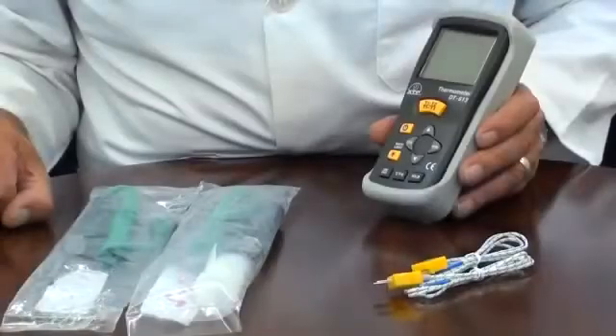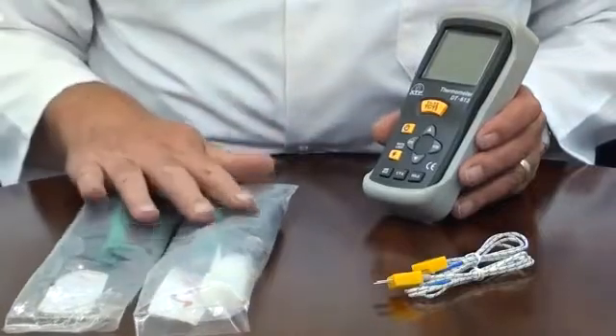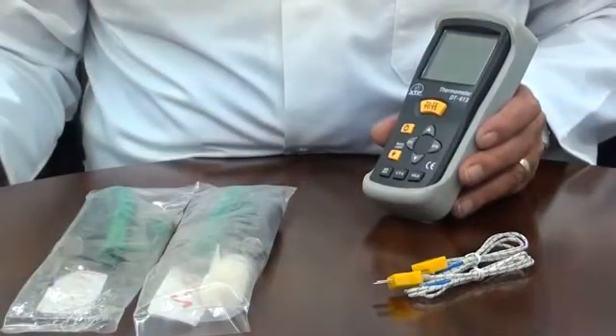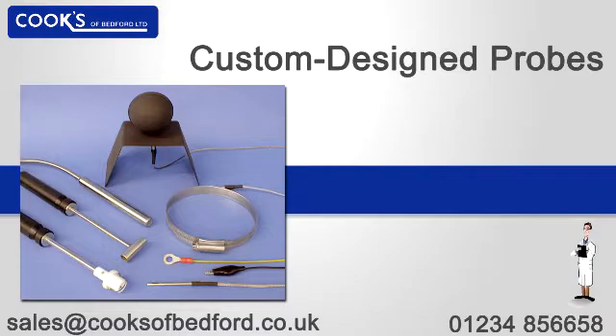The thermometer is ideal for many applications as we offer a range of interchangeable plug-in probes. These cover typical applications such as air, liquid, penetration, immersion, and surface temperature measurements. If you have an application that requires a specially designed probe, then we can manufacture to your own specification.